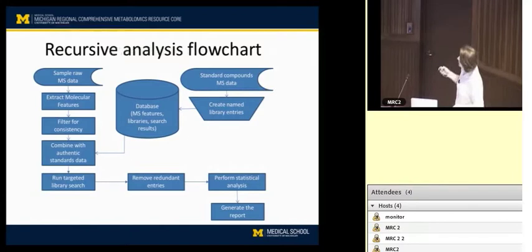We would filter for consistency once we've done some alignment and some additional analysis. We would go through and say, we're maybe going to get rid of something that's only present in 20% of all the pooled samples, for example. But again, we'll go into more detail later.